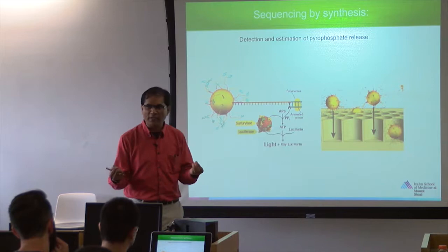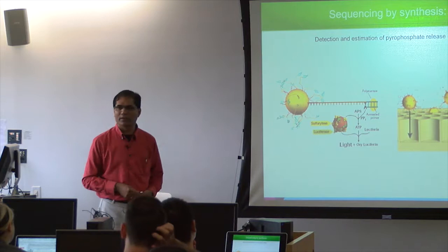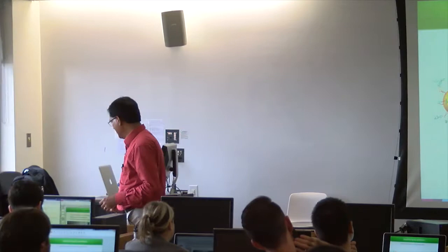You get so many strands of DNA, so many beads. You then stick them together. That's how you have to develop those; revive your high school mathematics and skills to do this. Okay, clear? So next, if you go through this, this is the 454.